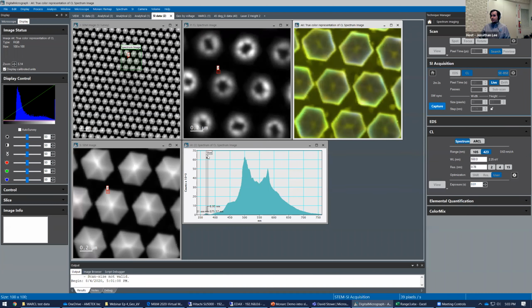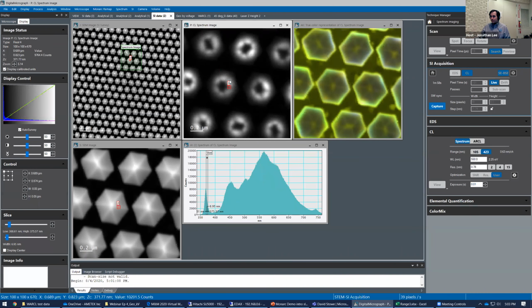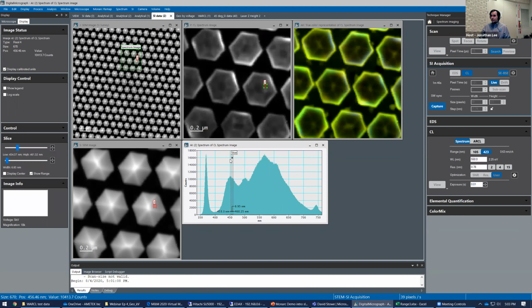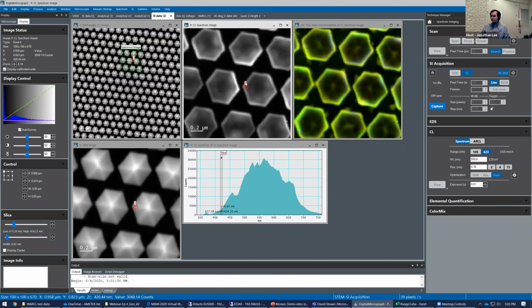Of course, there's a pretty hefty UV component that you wouldn't be able to see, but it would see you. And so that's spectrum imaging. It's a really useful technique. You get spectrum across the surface. You could see lots of interesting activity here and there.